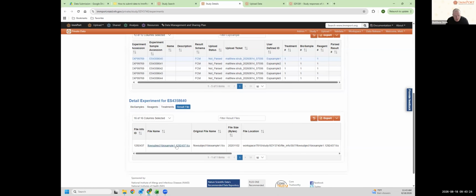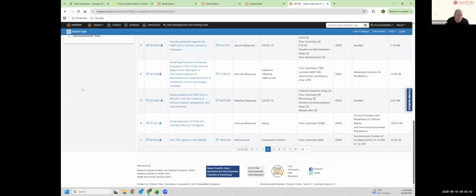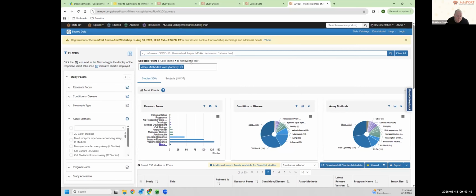So say this is all you want to do with this study, it's ready to be released. You reach out to the help desk or myself or Parisa, and we'll say that it's going to be released at the end of August. This kind of mock experiment here is not actually publicly released, but once a study is publicly released, I'll show you on the shared data page. If your study is this, for example, you can look for it.